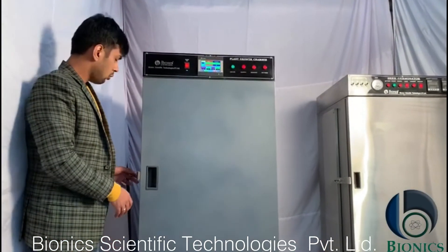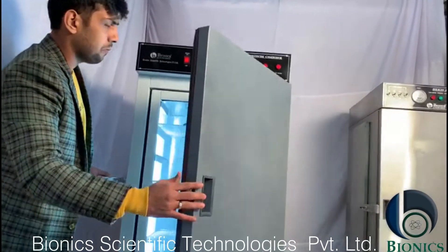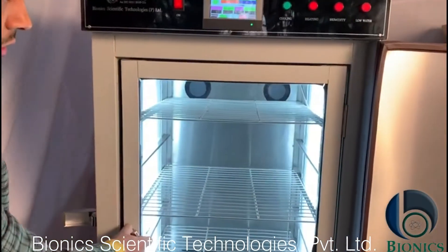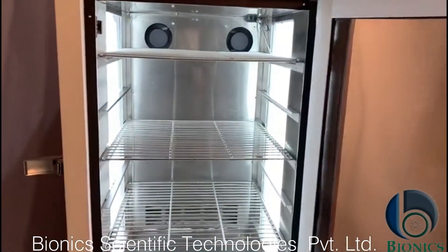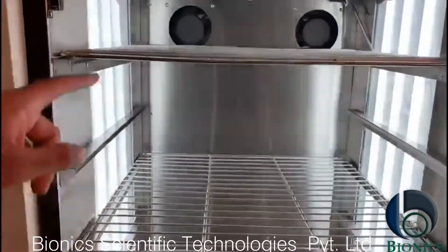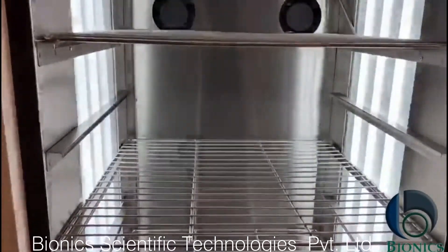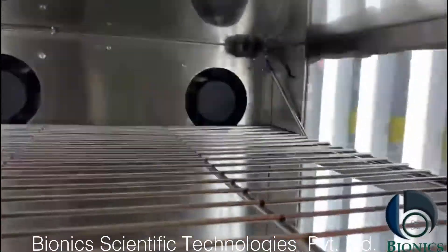Now I will tell you what is present inside. As you can see, there are two circulating fans which are present over here and these are three shelves, and on the right hand side, this is our temperature sensor which will sense the temperature.